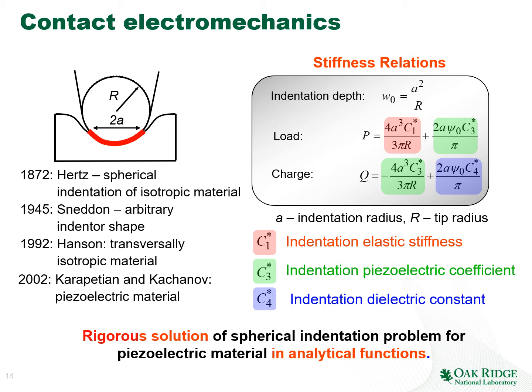So what they did was basically to derive the rigorous solution for spherical indentation for piezoelectric material in analytical form and summarize this in the form of stiffness relations.